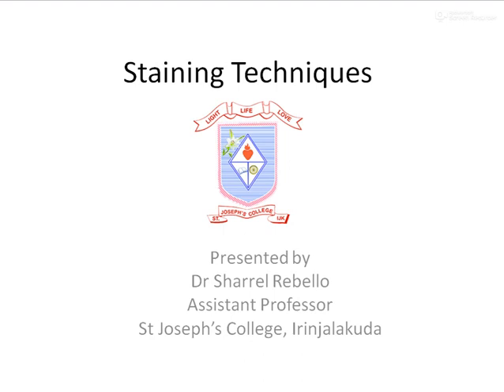Today we are going to talk about the staining techniques. We were discussing microscopy previously, and of course we know that when we view organisms, especially microorganisms under the microscope, their visibility as well as the clarity of the image becomes better when you stain your specimens, because a glass slide is transparent, and the microorganisms are mostly microscopic, too tiny in nature. And to view a microorganism within a glass slide would be quite difficult if you do not stain it.